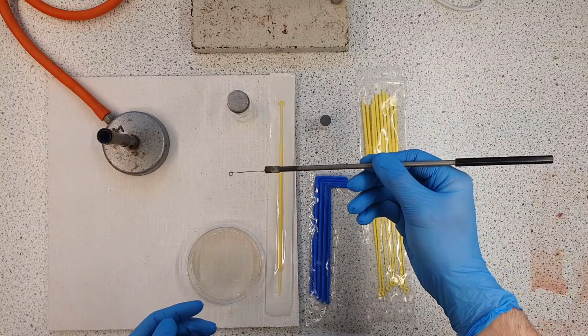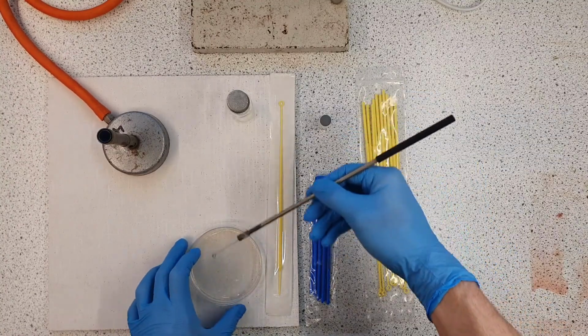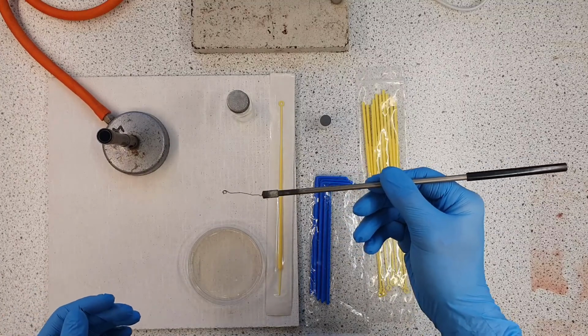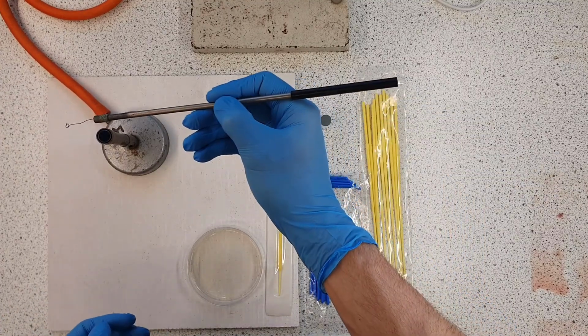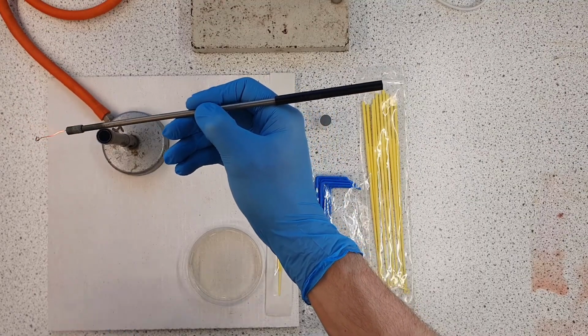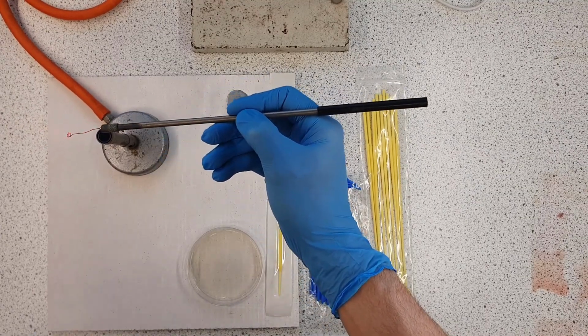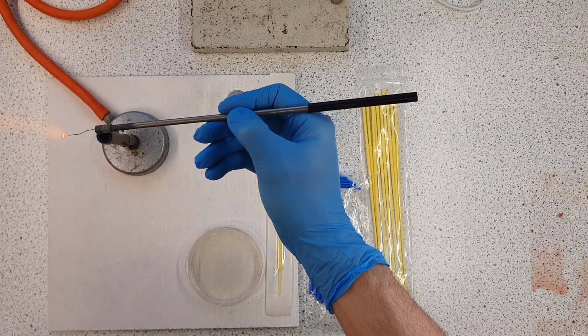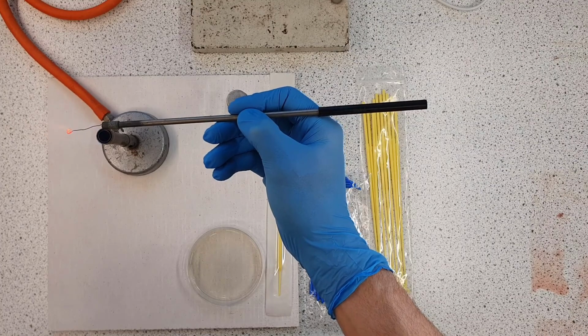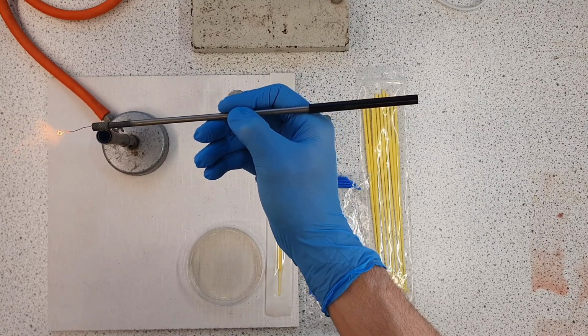Making sure you're adhering to other aseptic techniques, you'd then do what you need to do. You'd spread your lawn, and then as soon as you're done touching any bacteria, you do the exact same thing, a decontamination. Once you're done with that, you can put your wire loop down because it's been sterilised, and you're going to sterilise it again before you touch anything else with it. So just hold it in the flame, fairly straightforward. Make sure everything gets nice and red hot.